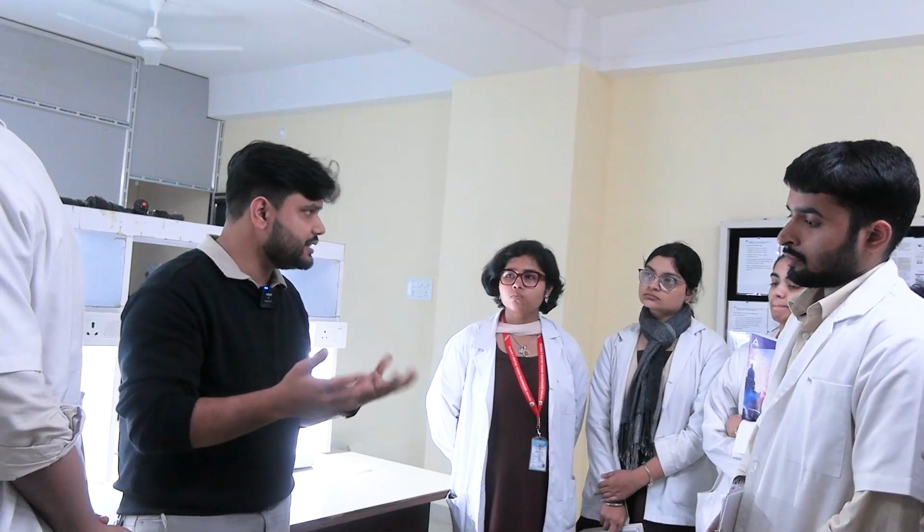So there are certain eggs and larvae which do not float even in a saturated salt solution. These are very heavy. For example, unfertilized eggs of Ascaris, larva of Strongyloides stercoralis, or Ancylostoma duodenale. You guys remember Ancylostoma duodenale? I've told you guys about larva migrans. They crawl under your skin. I've shown you a photo of this. Okay, these are larvae. Then we have got the Taenia eggs. Taenia, you guys remember? What are the two types of Taenia you know? Taenia solium, Taenia saginata, right? Okay. And finally, the operculated eggs of trematodes.